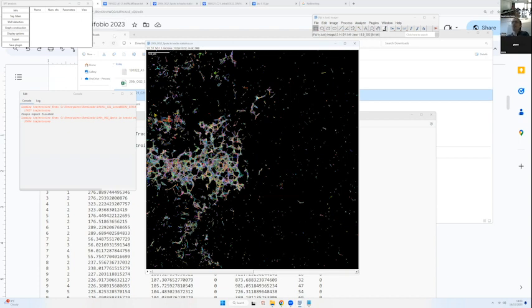And here you noted that we did not specify acquisition time or pixel size or whatever. But actually, if we go in the info, we will see that we have an acquisition time that has been computed from the trajectories directly. We don't know the pixel size because it's not specified, but we determine the acquisition time, which is 18 milliseconds.